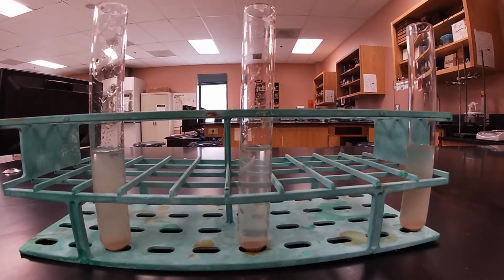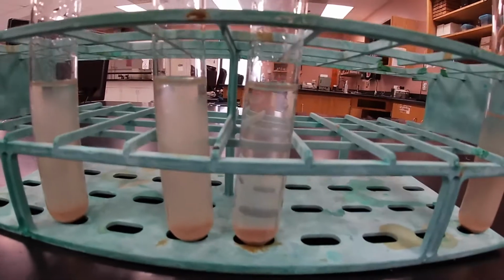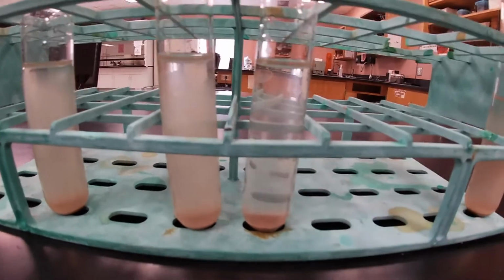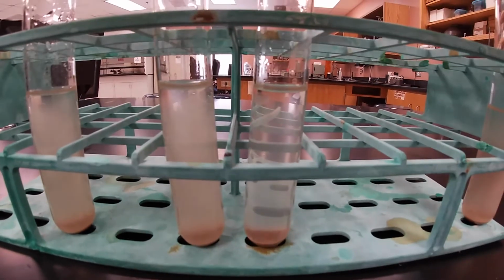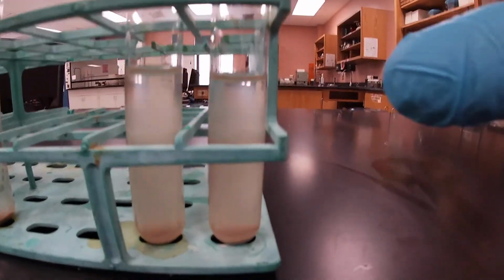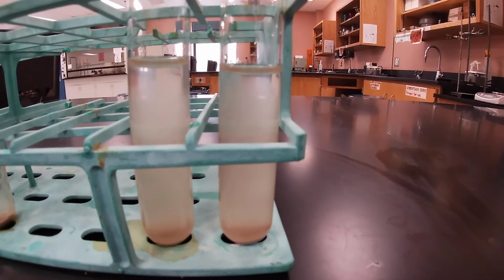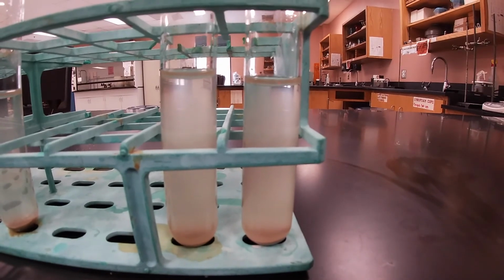Then we'll compare our standard with our aluminum sulfate, and if you notice here, it did clear up quite a bit, right? This one's the one with aluminum sulfate. And the last one here, we have sodium sulfate. As you can see, very similar, not much change. So that's after 30 minutes.